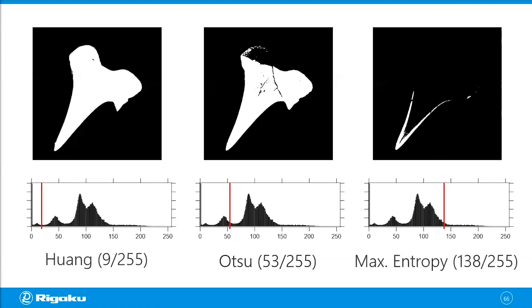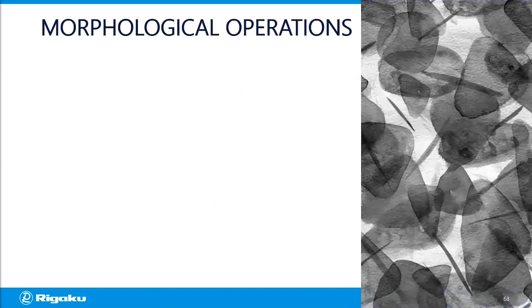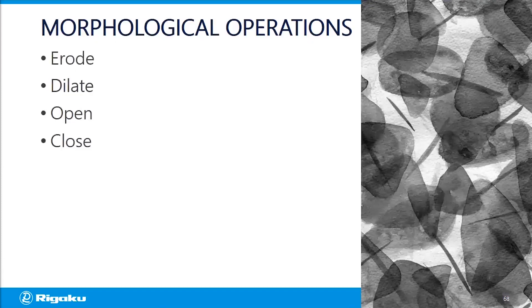Whatever method you use to set the threshold, you'll have the objects segmented from the background. When you look at the result and like it, you can move on. But often you'll look at the segmentation and think the objects are a little too big, too small, too connected, or too separated. Then you'd have to do some optimization or cleanup, and one of the things you can do is use morphological operations. Basic operations include erode, dilate, open, and close.